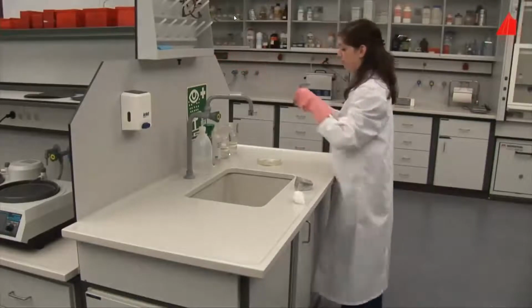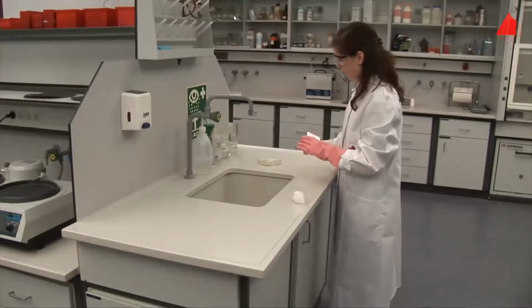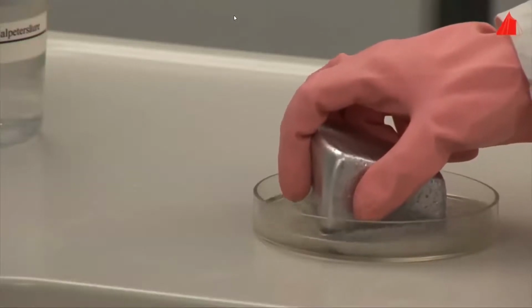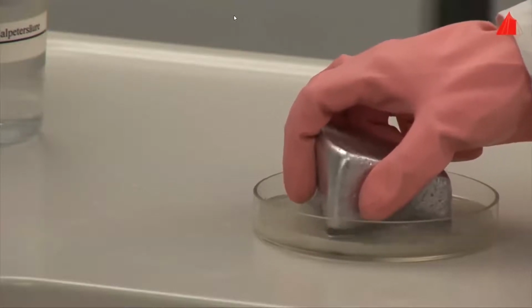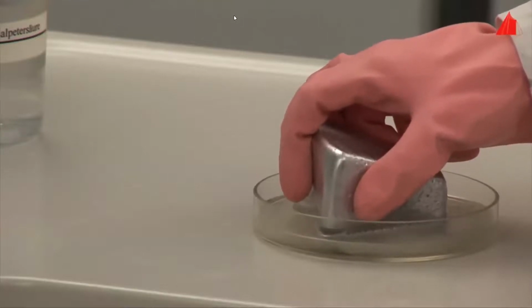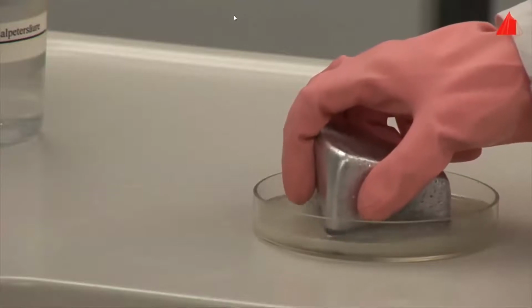Our sample reveals its structure only by the final etching process. After washing and drying the sample, the material tester dips the ground surface into a suitable etchant. In this case, the etchant consists of a mixture of different acids. Special care should be taken here. The material tester protects herself with a lab coat, special gloves and safety glasses.